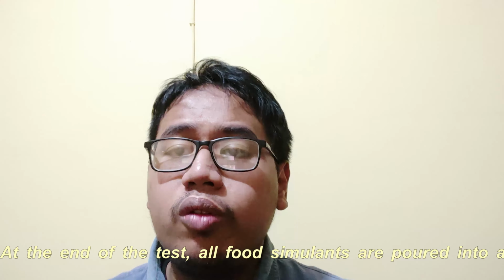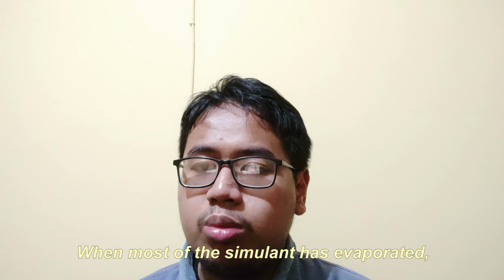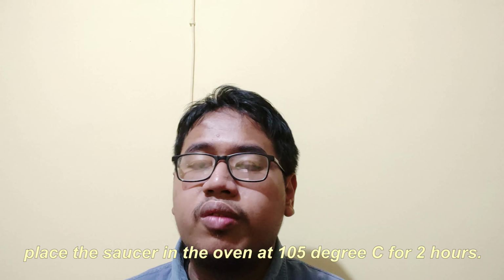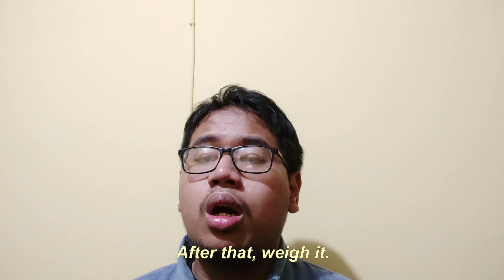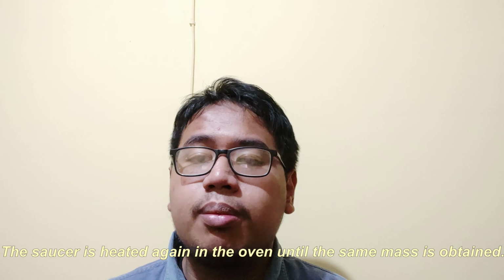At the end of the test, all food simulants are poured into a pre-weighed cup and evaporated using a hot plate. The samples were rinsed with 10 ml of simulant and poured into individual dishes. During evaporation, the evaporation temperature is kept below the boiling point of each simulant to avoid loss of the simulant due to splashing. When most of the simulant has evaporated, place the saucer in the oven at 105 degrees centigrade for 2 hours. After that, the practitioner will weigh it. The saucer is heated again in the oven until the same mass is obtained.